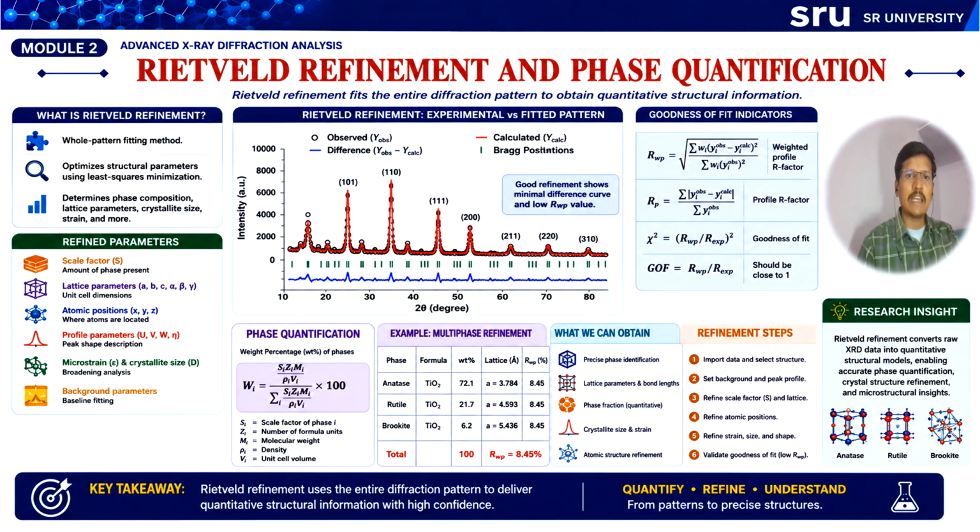These all we can calculate using this Rietveld refinement method. There are several refinement methods, so one can use any method, but the refinement process is almost the same. This makes the method extremely powerful for structural characterization.